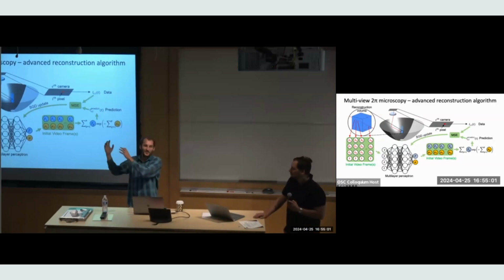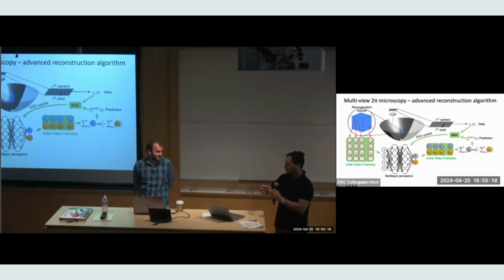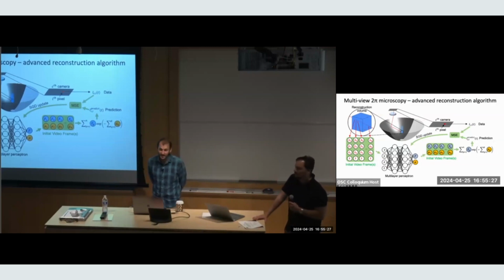In the microscope, if there's a bush in front of your microscope, you can just move it because that shouldn't be in your lab. But maybe there's tissue or other things, and you're trying to see further beneath it. Yes, that was what I was thinking. Perhaps we haven't tried this. If the occluder is so big in the field of view that you really cannot do something, but if you have more of a bush kind of occluder, then it's a good thought.